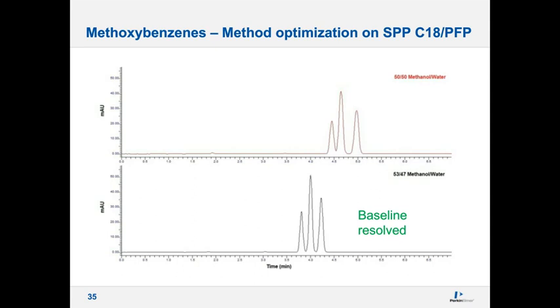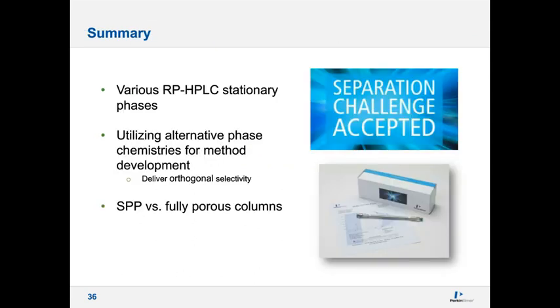So in summary, the C18 phase is still the workhorse for many applications, but its dominance has reduced as the complexity of samples has increased. And there are now many stationary phases available on the market which hold benefit for various applications. Initial screening of various phase chemistries using the same mobile phase conditions is often one of the most powerful approaches in method development to observe changes in selectivity and improve the likelihood of separating closely related species or difficult analytes in a mixture, as they can provide alternative modes of interaction and retention characteristics.